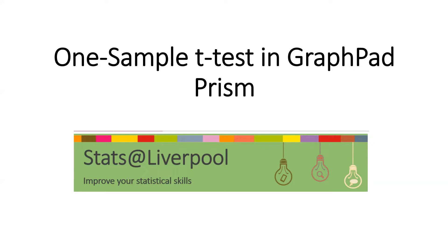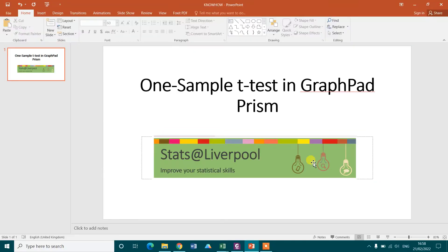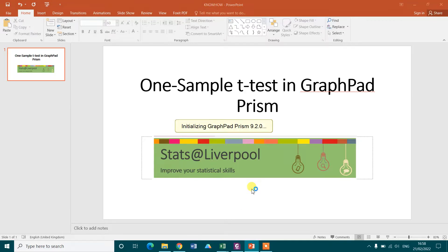In this video tutorial I will show how we can perform one sample t-test in the software GraphPad Prism. So let's open the software GraphPad Prism first.